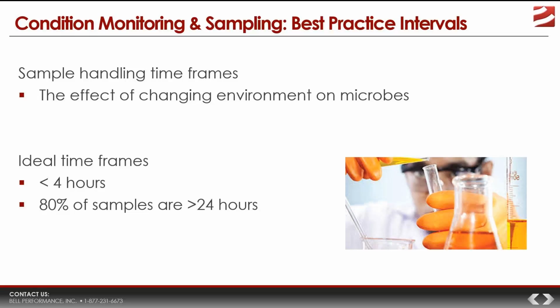They have adjusted their life cycles so that they can live and grow based on what they find in there. Now you're going to sample them. You're going to take some of those microbes out of that living environment. Well, not all of them are entirely tolerant to that kind of thing.